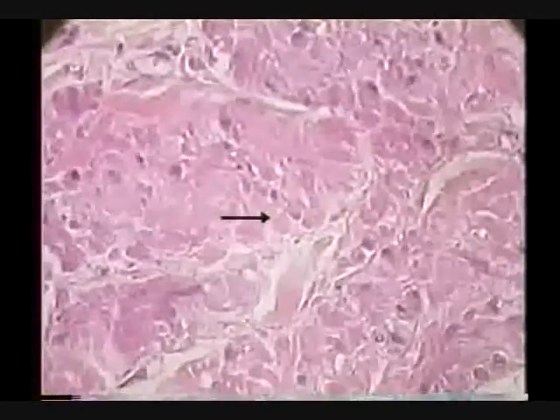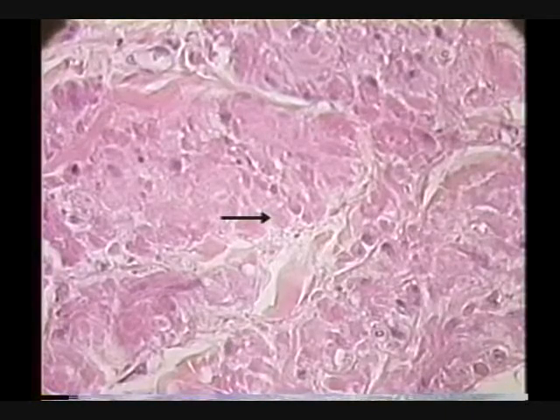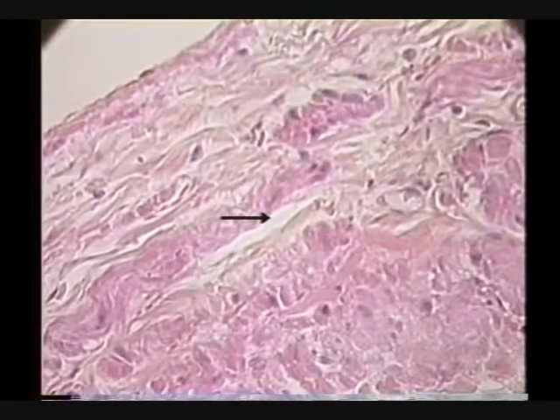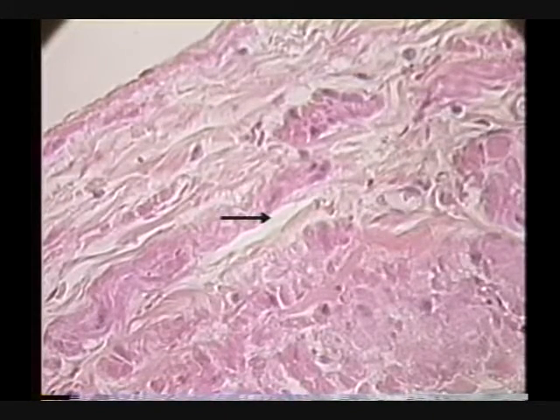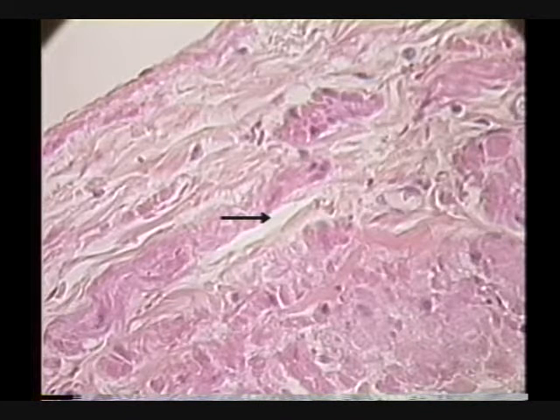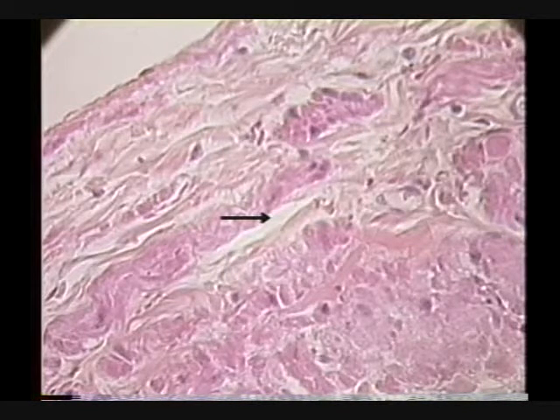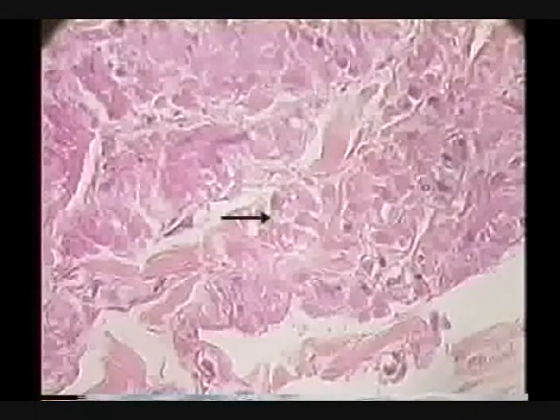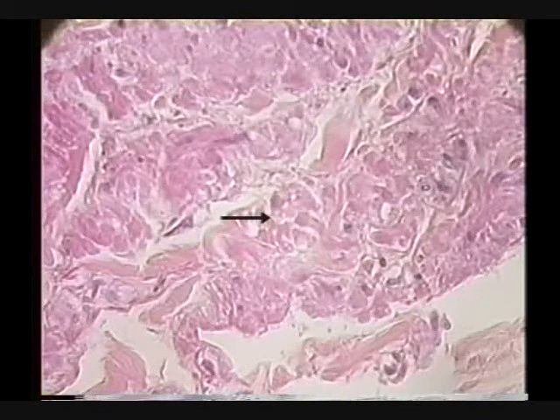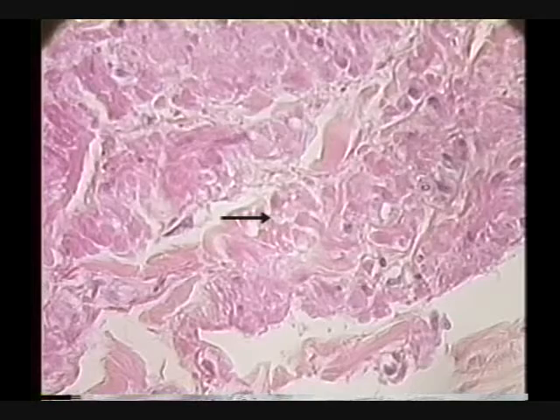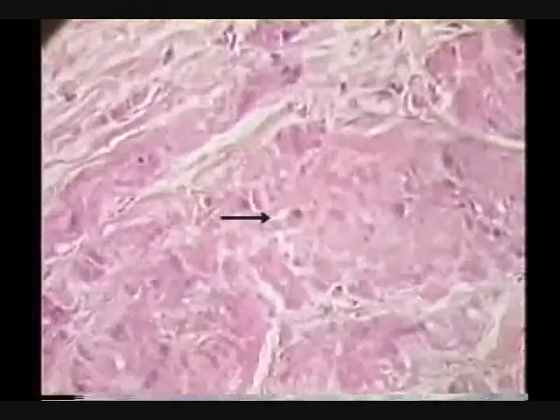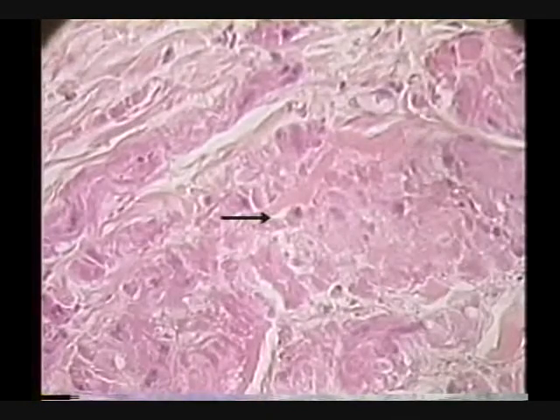Notice the view - it's cut in cross section. This is a cross section of a large vein, like a piece of jugular vein. These very large veins have smooth muscle in bundles, in little clumps, and you can see it's not real continuous - running lengthwise. They say it's in the tunica externa. So this is smooth muscle running lengthwise in the tunica externa of this large vein.